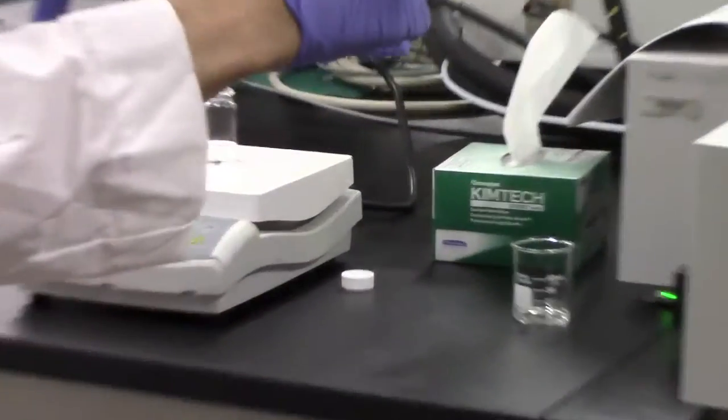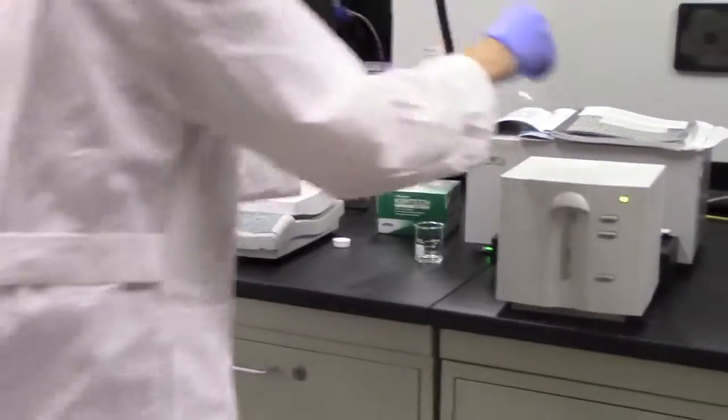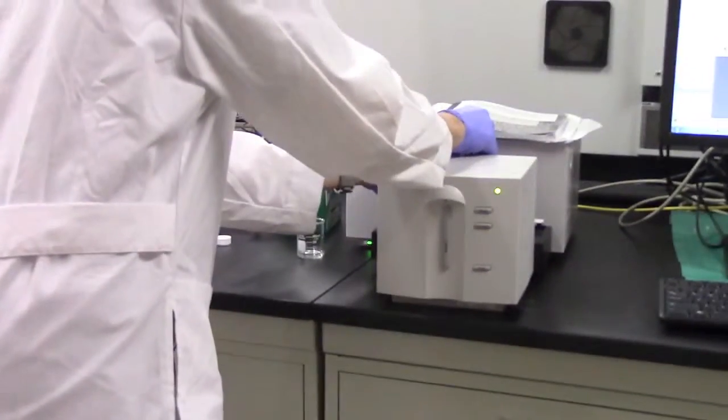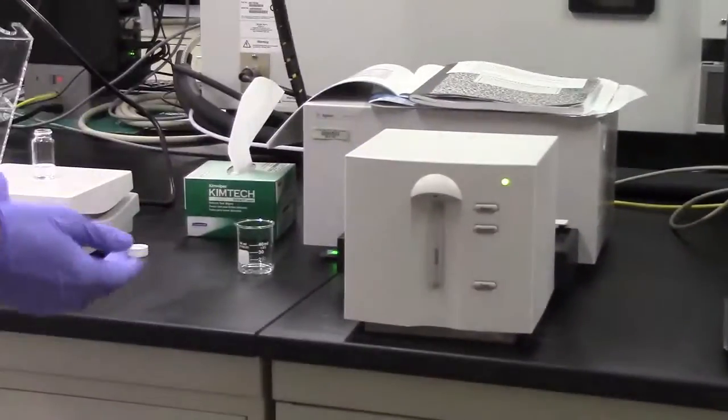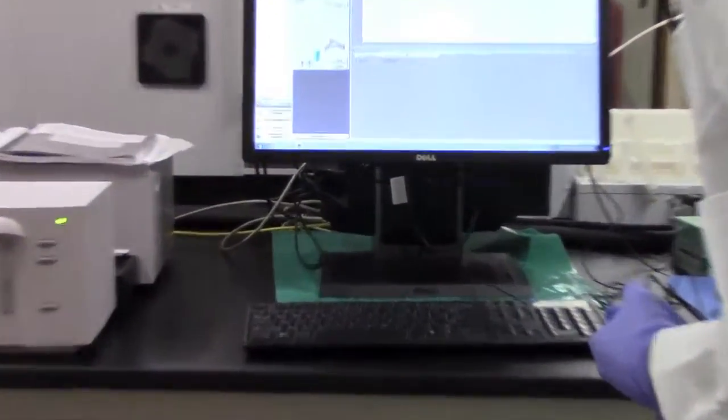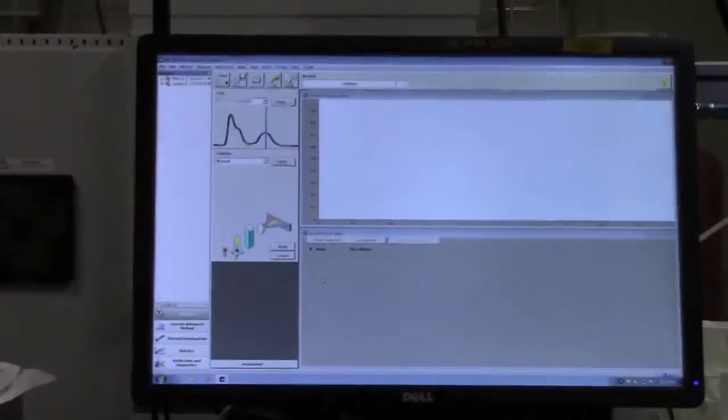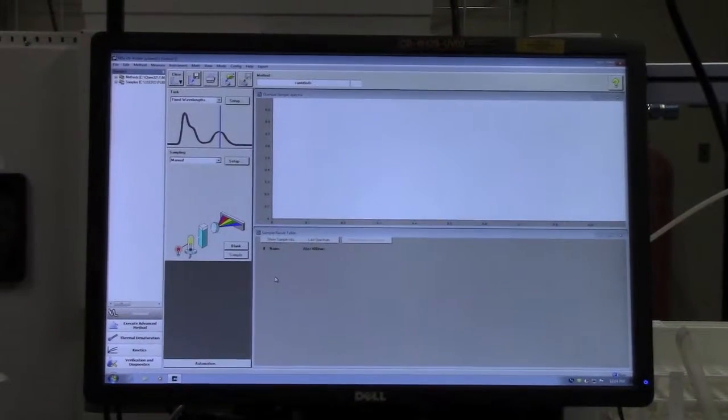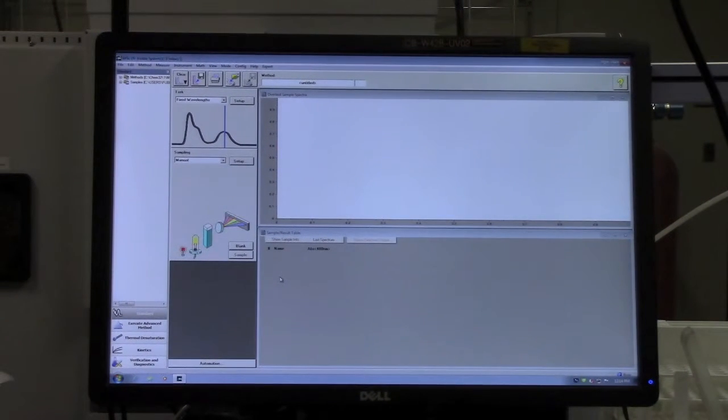Quickly cap the cuvette, place it in the instrument, and you can proceed to take your initial sample on the instrument.